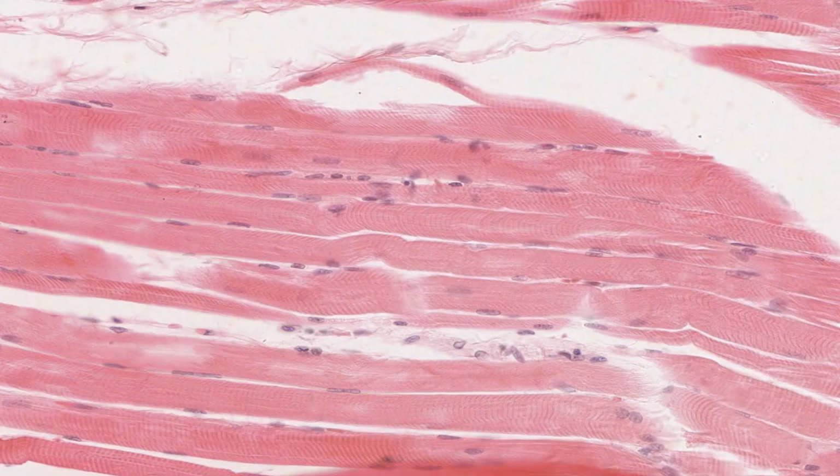Look very carefully at sections cut longitudinally here and here, and note the cross bands or striations show up particularly well. This banding reflects the A and I banding pattern in sarcomeres due to the regular arrangement of thick and thin myofilaments organised in each myofibril.